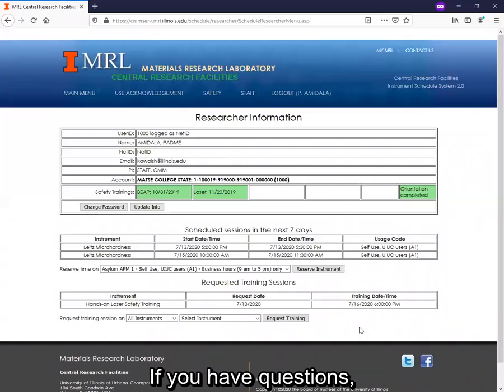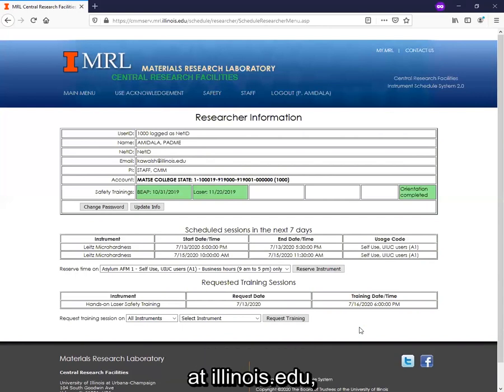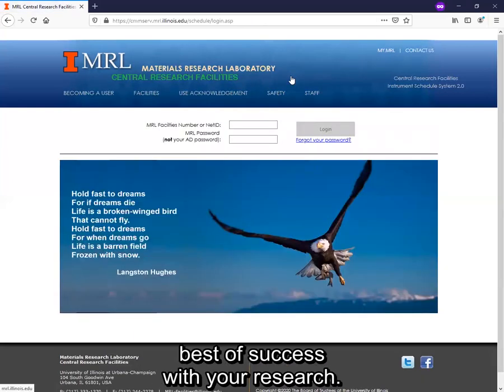If you have questions, please email mrl-orientation@illinois.edu and we will help you out. If you think there's something wrong in the schedule system, then report a bug. Otherwise, log out, and we wish you the best of success with your research.